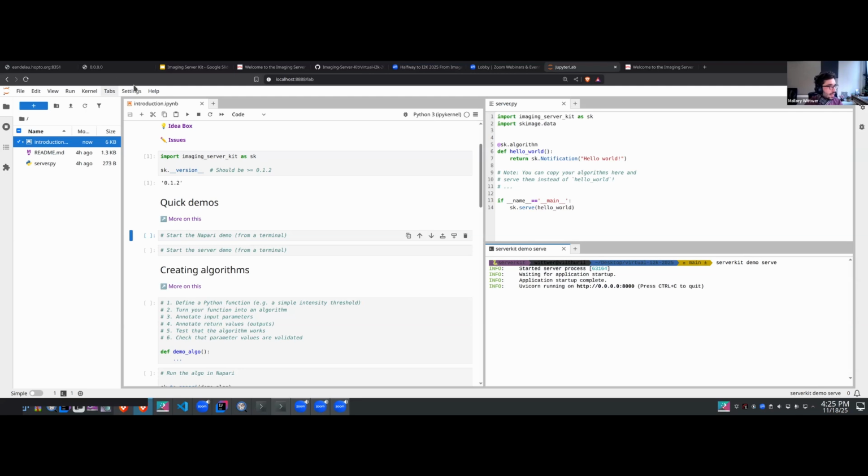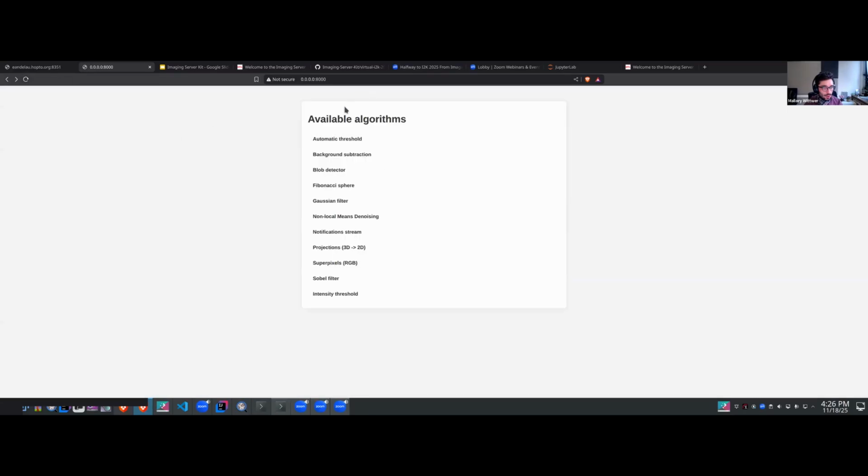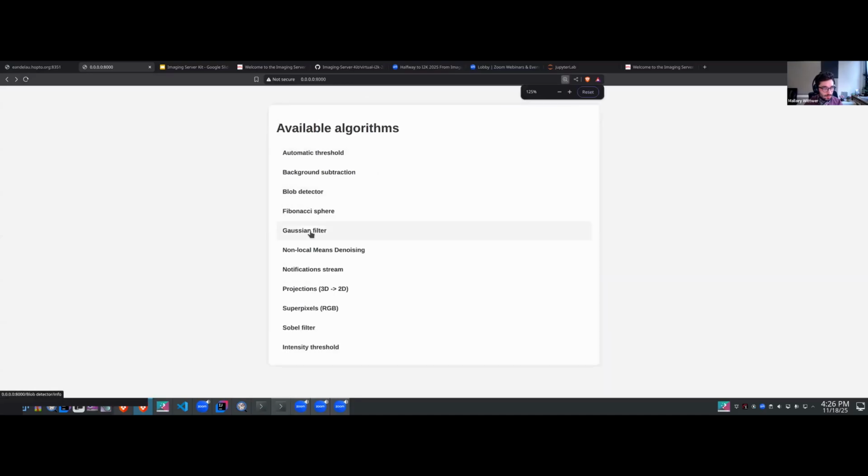Interestingly, if you actually navigate to that URL in a web browser, I will refresh this page. You can see that things are actually happening. We serve a little web page at the localhost 8000 address.